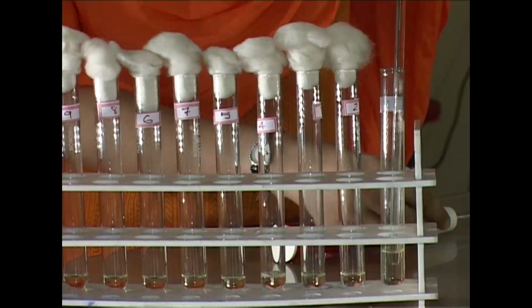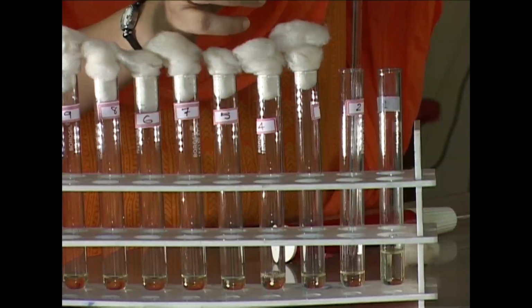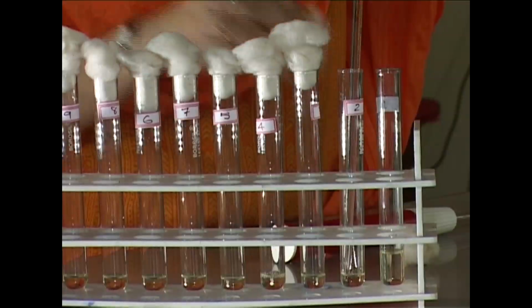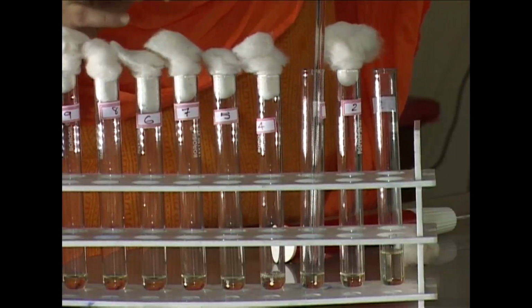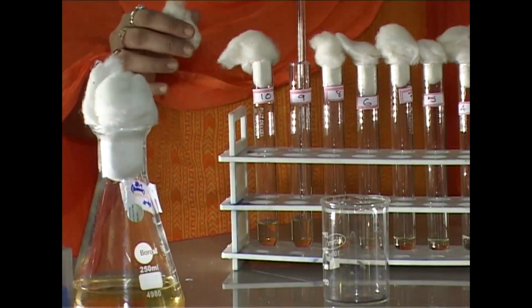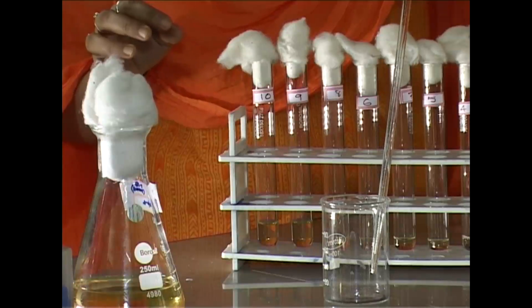Now, the antibiotic is serially diluted with the help of broth. Take 2 ml of nutrient broth medium in sterile tube number 2, and then you add penicillin 2 ml. So it totals 4 ml. You again take up 2 ml and transfer it to tube number 3. In this way, you go for the serial dilution till tube number 9. Afterwards, from tube number 9, you discard the extra 2 ml. So the total volume till now from 1 to 9 is 2 ml.